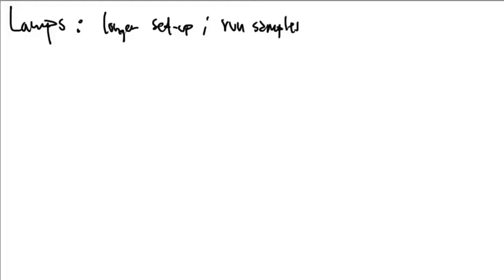People understand that it takes longer to start the machine up every day than it does to run samples, because each sample will only take a couple of seconds and it's done. Your job is finished for the day. But to set the instrument up the proper way, sometimes that can take hours. So that's always the struggle with the AA field.